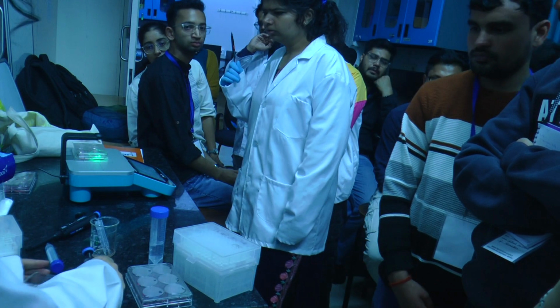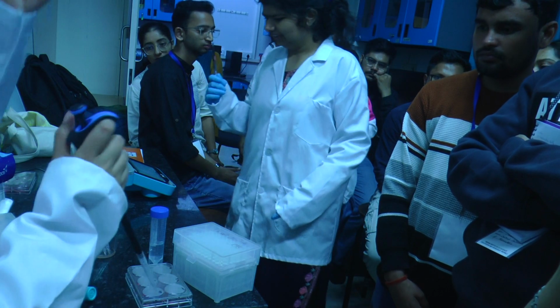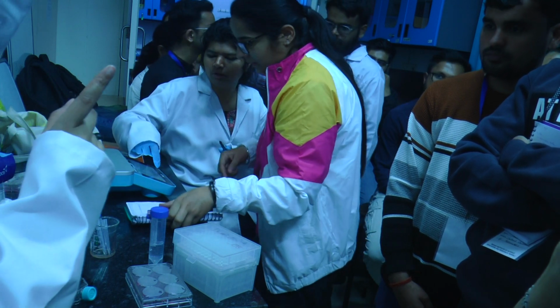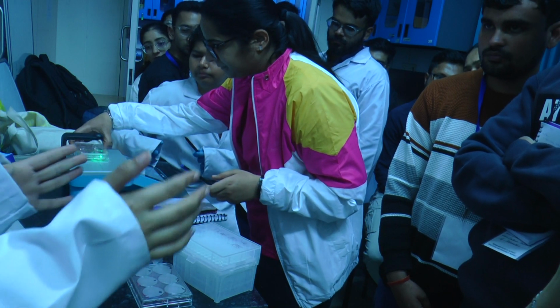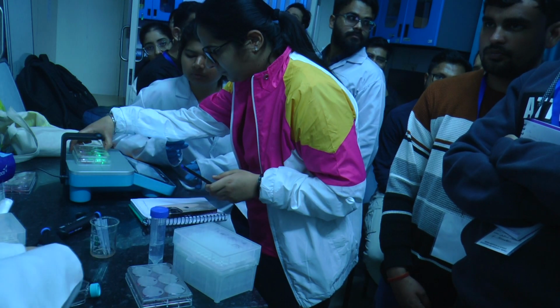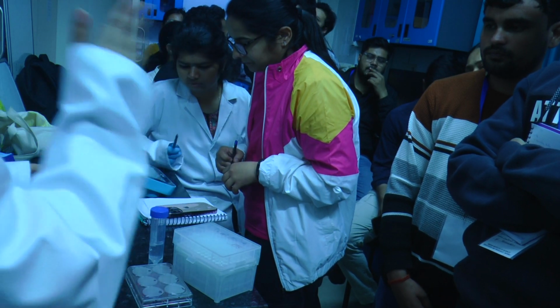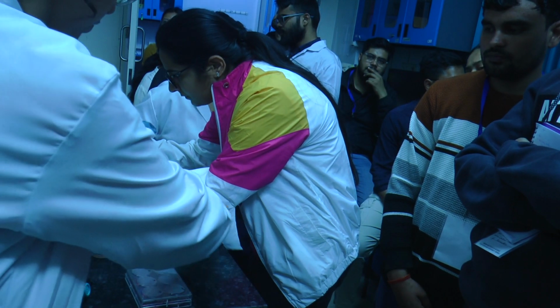And then after this, I have to keep it at 37 degrees Celsius. Here I don't need the CO2 and other conditions, so I can even use the normal incubator, the one you used yesterday. I usually do it for 10-15 minutes, but even after half an hour you can keep shaking it so that the GPMVs which are coming out can keep getting isolated from the cells.